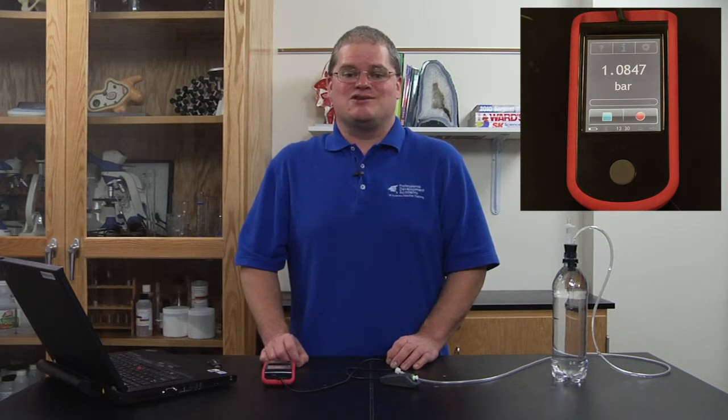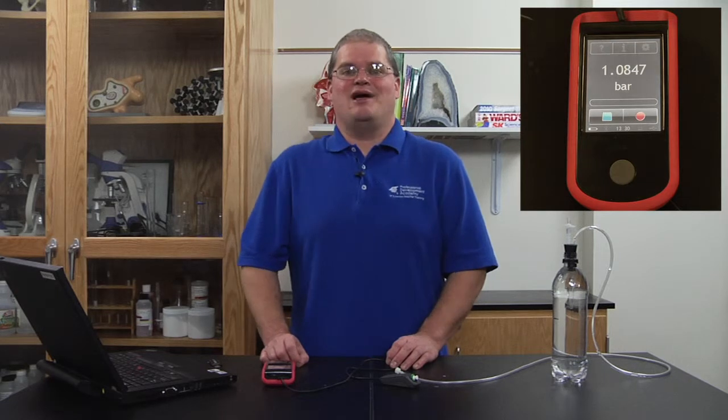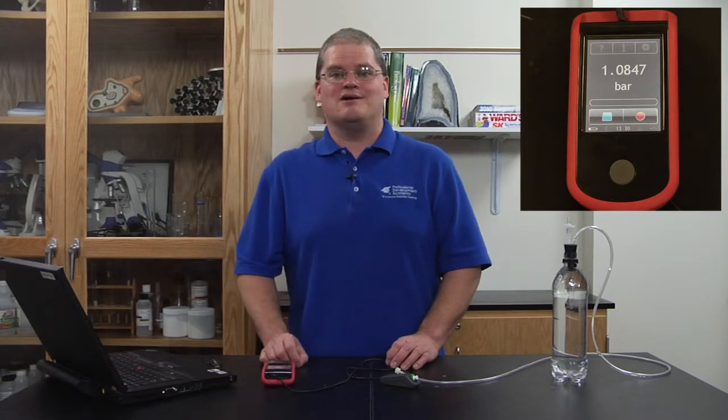The Gas Pressure Red Data Collector can display and record in the units of bars, atmospheres, psi, or kilopascals.